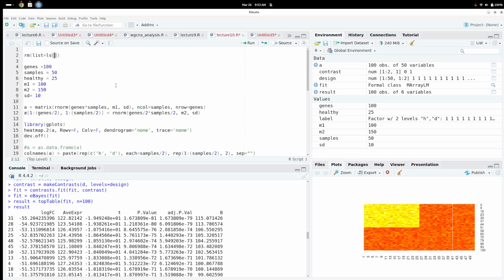It's an easy example. So first, you see whenever we run something in R, perhaps the memory of the workspace is full, maybe from other scripts that we have written. The problem with these objects here is that they are also shared in the script that we write.